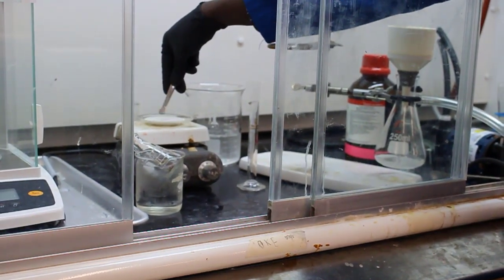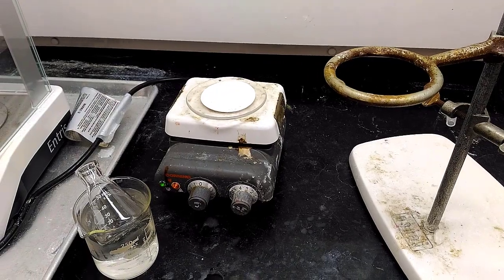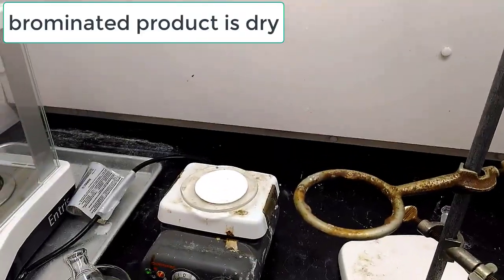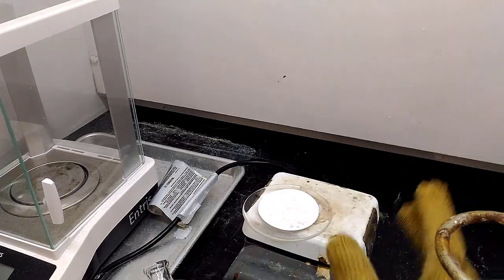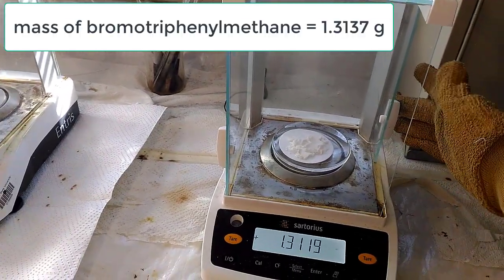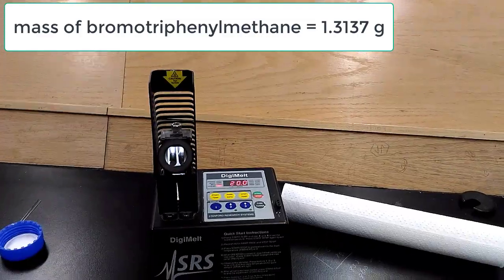They're heating it up and in a moment it jumps ahead to where the brominated product is dry. They then weigh it. Since they already tared the watch glass and filter paper, the mass shown is the product: bromotriphenylmethane — 1.3137 grams.